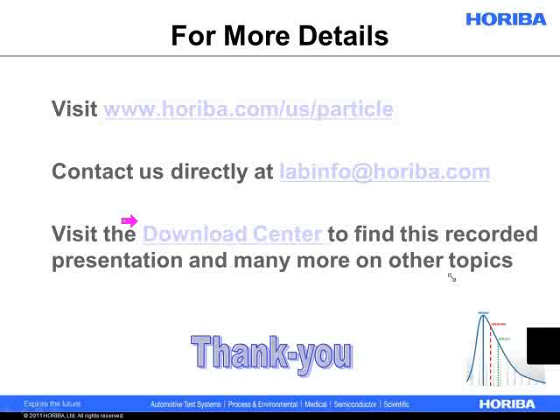So in that case, the particle is tumbling in such a way that the laser can see the head-on projection and report it as a separate distribution. And that's kind of neat, actually, because the head-on projection gives you an idea of what the width of the particle is, assuming that in this case, the needle can be described by the length and width, and the depth isn't any different than the width.